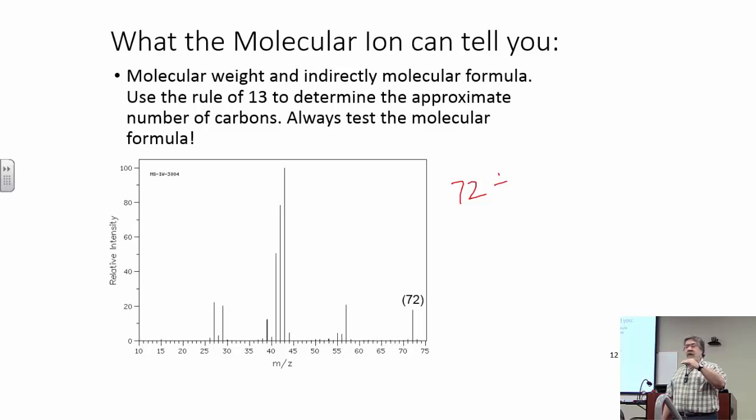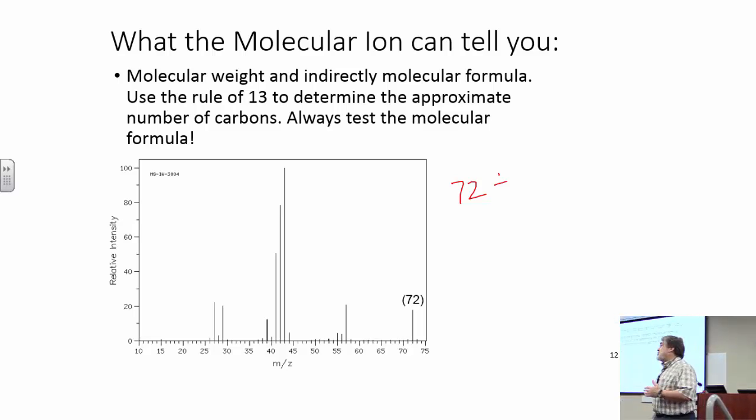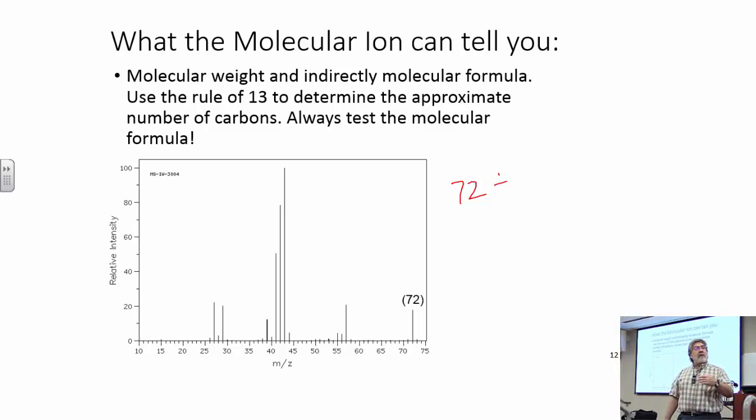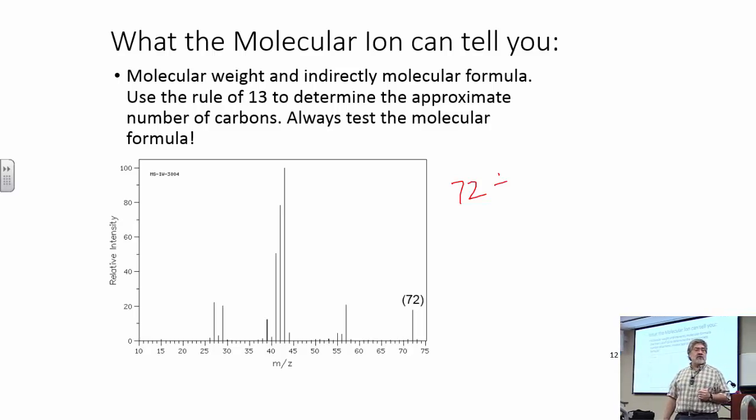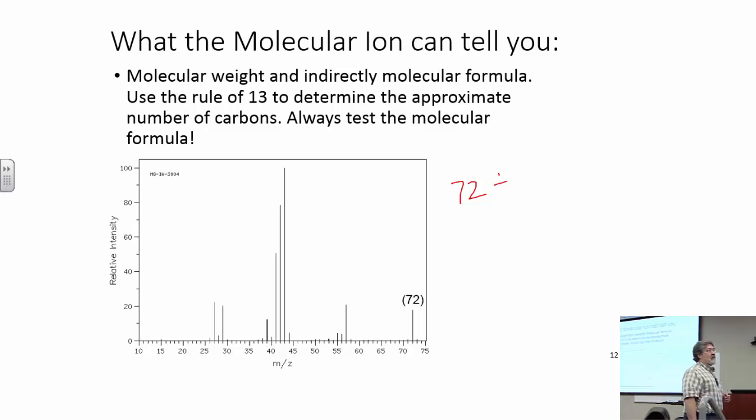So if we had calculated C5H10 as the molecular formula that would have corresponded with the molecular ion, then that would be a legitimate formula too because it's less than CnH2n+2. That predicts 12 is the maximum number of hydrogens that could be on 5 carbons.